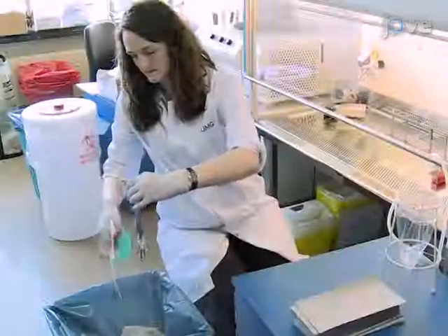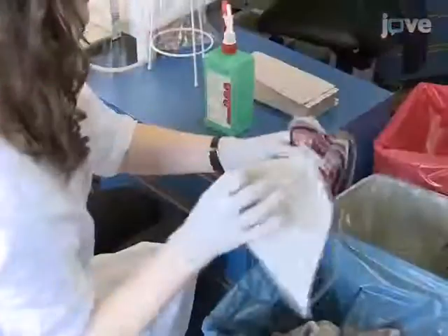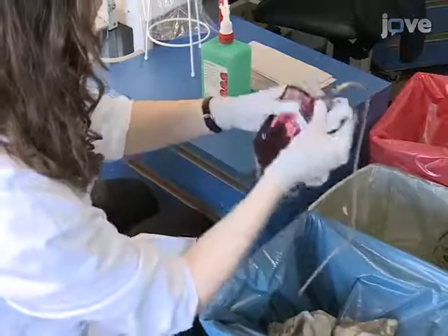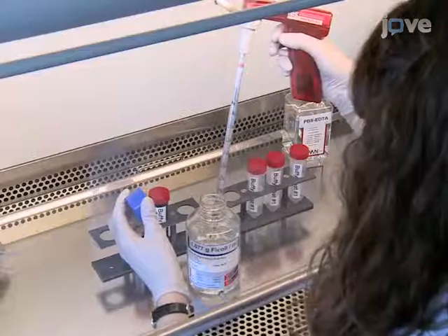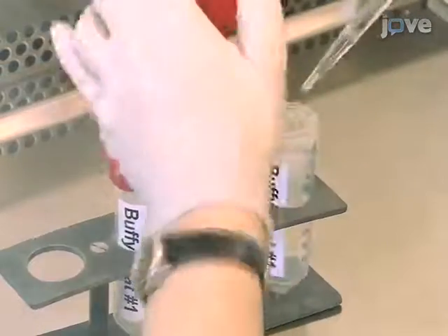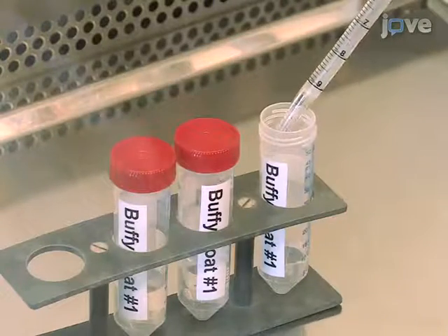This protocol is performed in duplicate to make balancing the rotors easier. Begin by disinfecting two bags of the Buffy coat fraction from layered blood, then transfer the Buffy coats to two 50-milliliter tubes. For each Buffy coat, prepare three 50-milliliter tubes with 15 milliliters of room-temperature FICOL solution at 1.077 grams per milliliter.